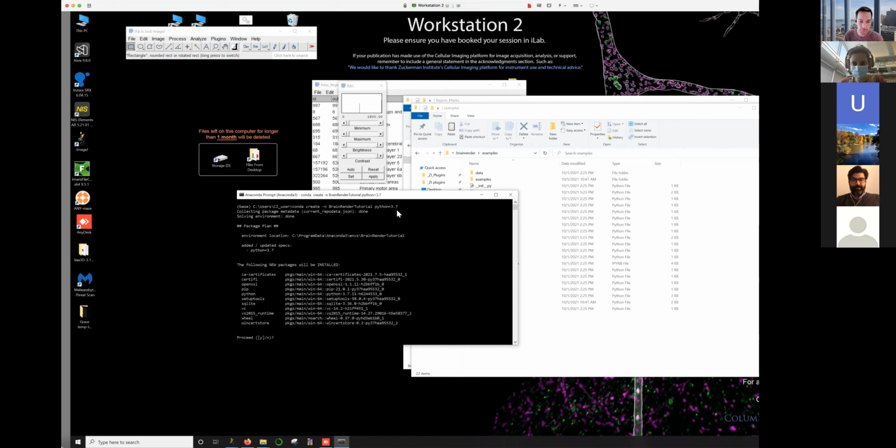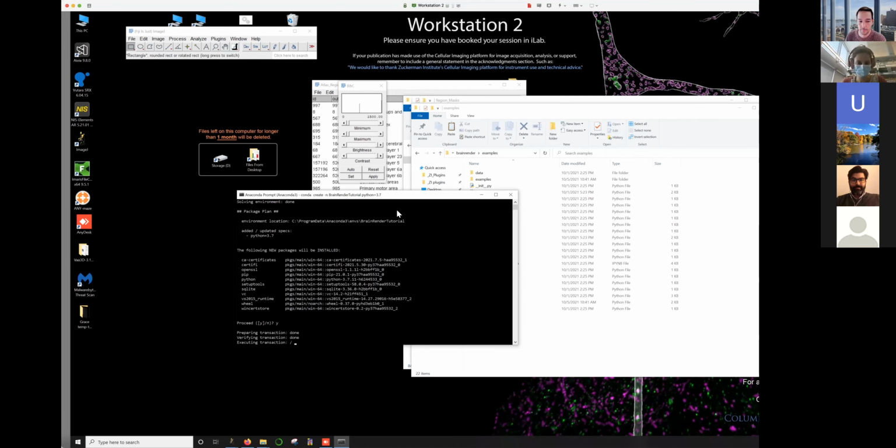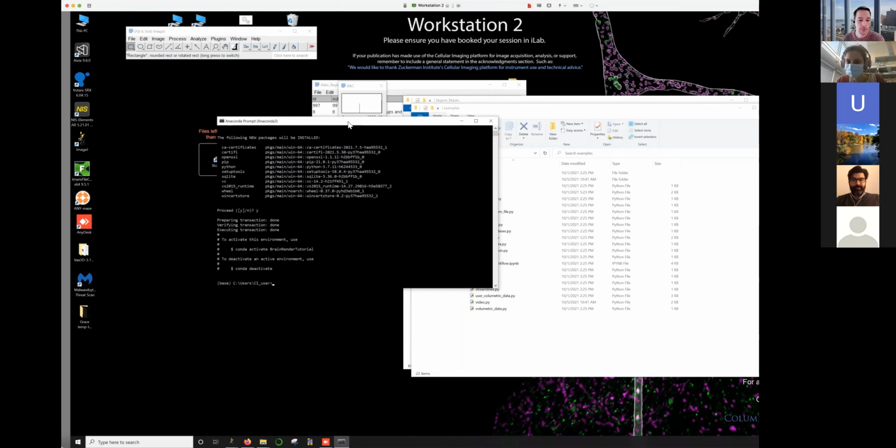And you can just say yes here. This is just going to install some basic packages. This will be pretty quick. Okay, so mine's done now.